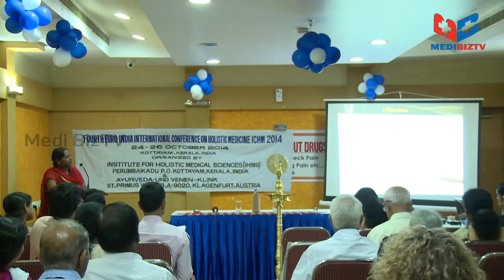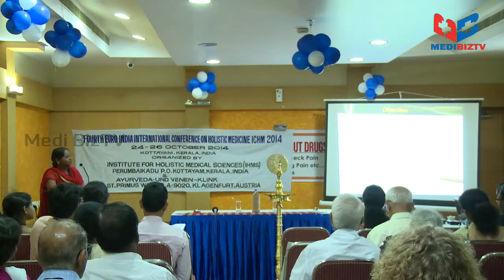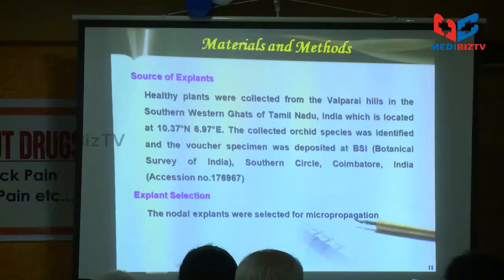Coming to the objectives: to standardize an efficient protocol for mass propagation of Anectochilus elatus from nodal explants, and to study the effect of various plant growth regulators on mass multiplication and establishment of in vitro raised plantlets.